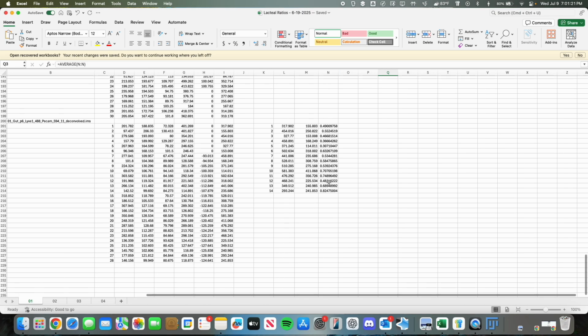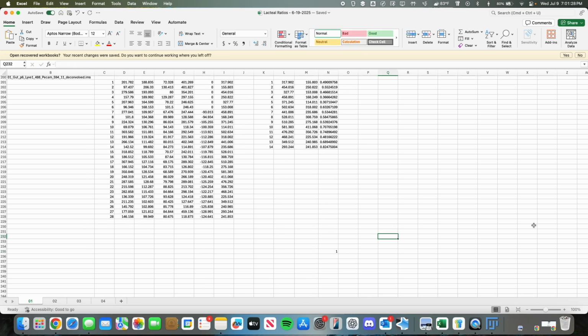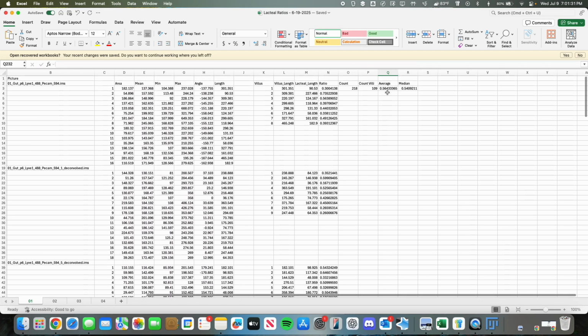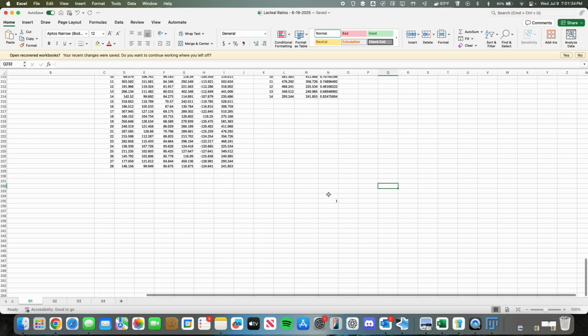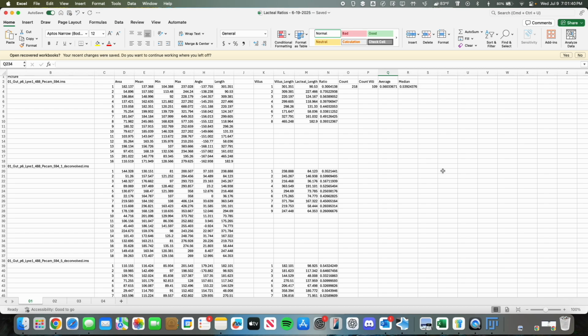So no matter how long I keep going, if I keep adding values, say I add a 1 right here, you'll see that my average will go up by a little bit, so it's at 0.564, but if you remove that, it's going to go down a little bit. So it's better to have a larger number of values, as that means we can get a more, at least per se, accurate average. And then it tells you the median, which is approximately 0.539 for that ratio count. So that's kind of how we organized it here.